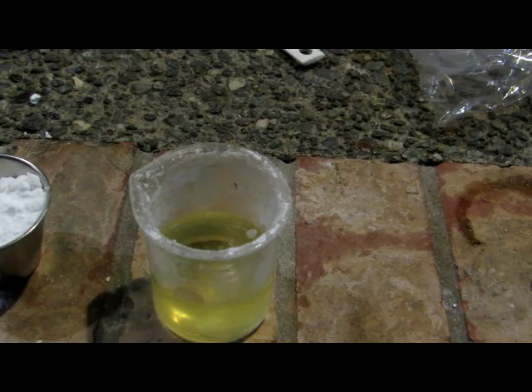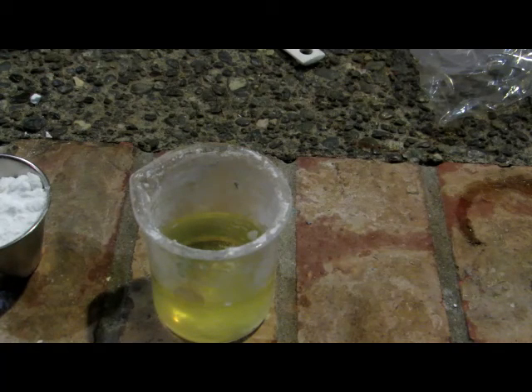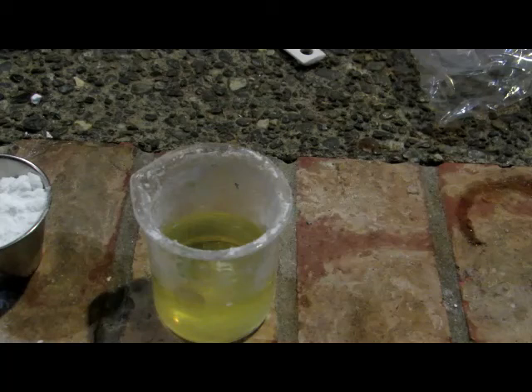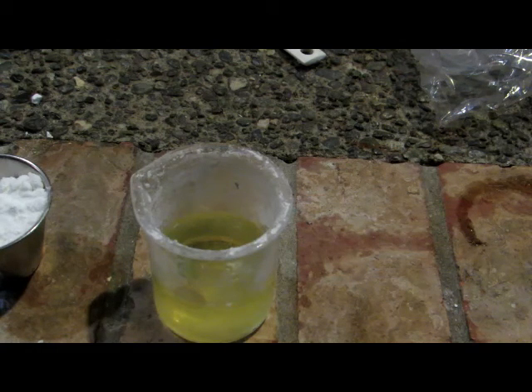Next we're going to slowly add our lithium hydroxide into the beaker, stirring occasionally. This is going to form lithium hydroperoxide, which can then be decomposed into lithium peroxide. We added in excess hydrogen peroxide just because hydrogen peroxide when heated will decompose into oxygen gas readily, and this reaction can be exothermic, so we wanted to make sure we had enough hydrogen peroxide to react with everything.